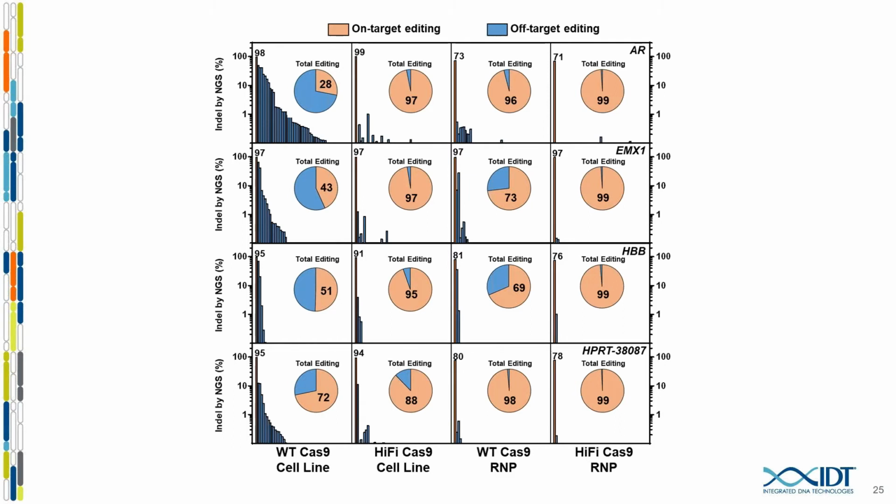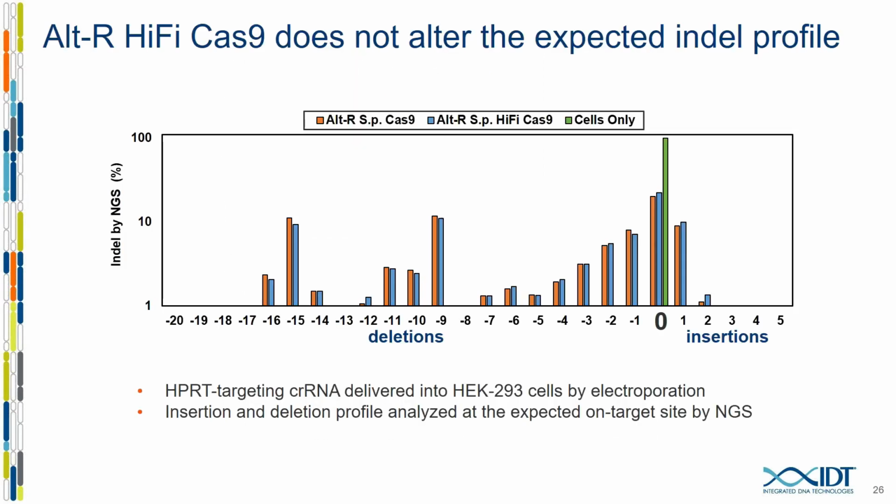And we've received some pretty great questions when presenting it at conferences or posters at conferences. And one that came up is, you guys have introduced mutations into Cas9, but how do you know that you haven't changed the nature of the cleaved products in a way where using this mutant is going to affect the repair profile? So we actually took a look at that.